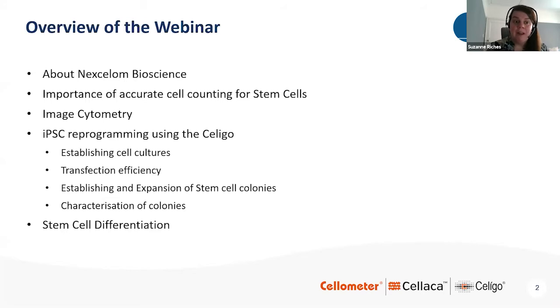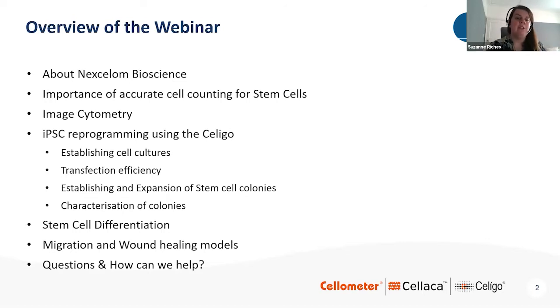The last couple of applications I did want to cover is differentiation and how you would look at that using imaging. And some people doing stem cell research are also very interested in that coupled with migration and wound healing models. So I just wanted to touch on that at the end as well. And then we should have plenty of time for any questions.